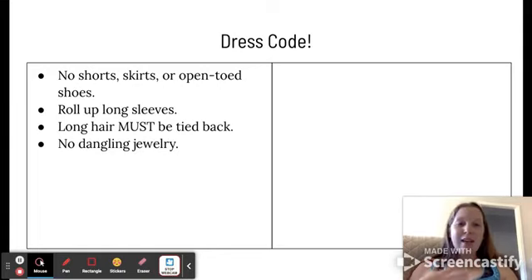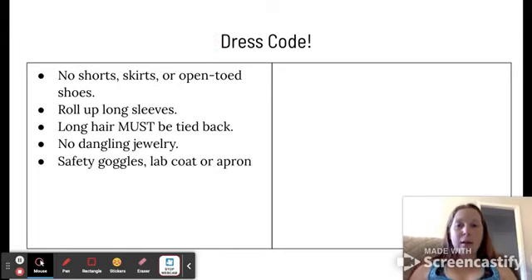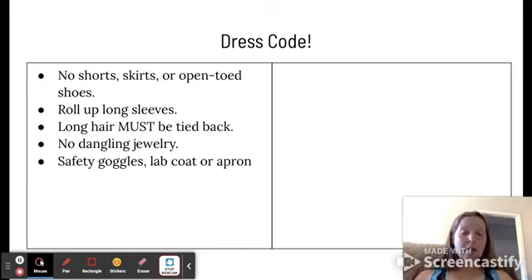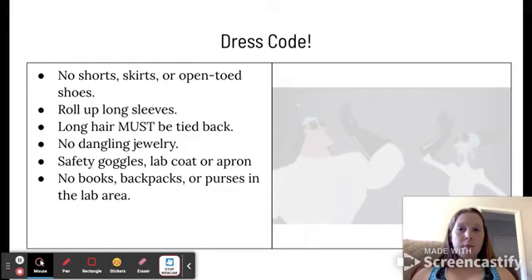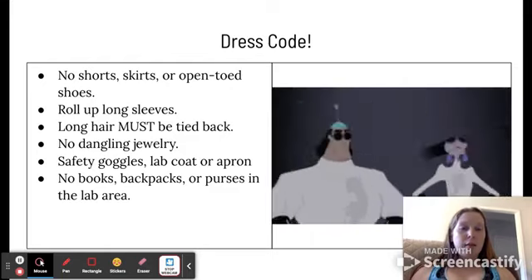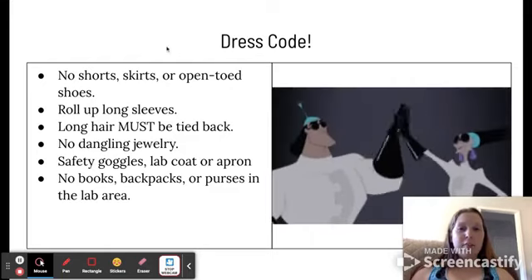No dangling jewelry, necklaces, bracelets, earrings. Just make sure you take those off before the lab. Safety goggles are a must for every lab. No questions asked. Depending on what chemicals we're using, I might have you wear an apron. Lab coats are more for higher level, so we don't really worry so much about those. And again, keep your walkways clear. Get rid of books, book bags, pocket books, things like that.